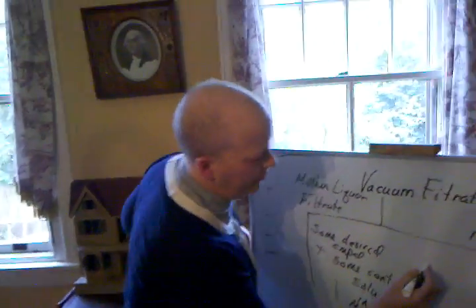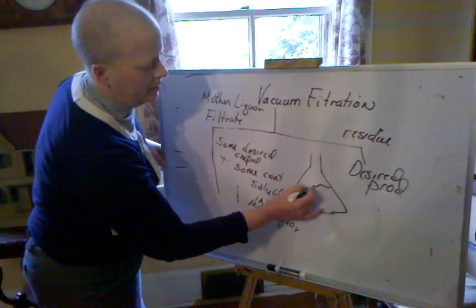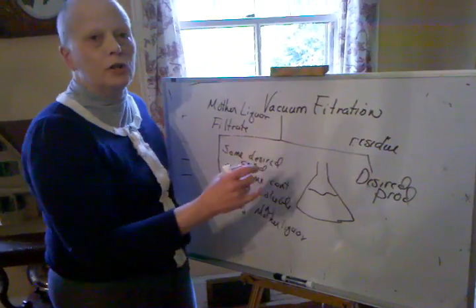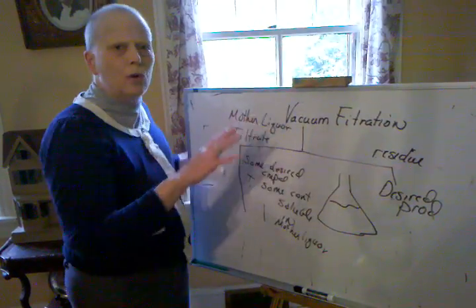The thing you have to realize is when these crystals grow, like if you have a flask, and you have allowed this flask, you have put in the minimum amount of hot solvent. You took the insoluble contaminants out by hot gravity filtration, and you got the solution through hot.